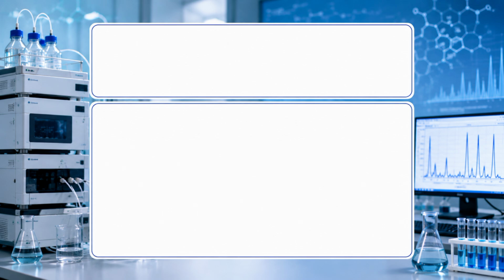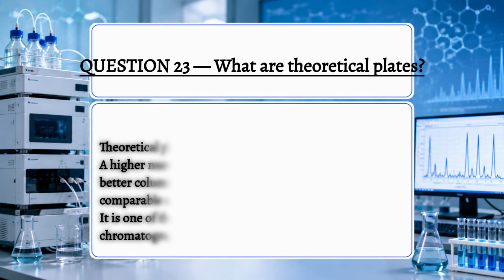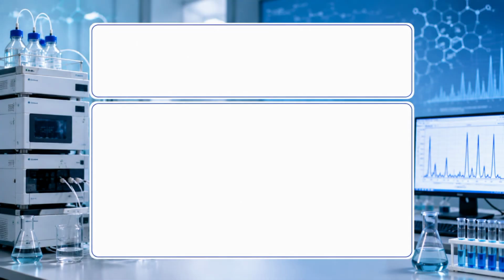Question 23. What are theoretical plates? Theoretical plates are a measure of column efficiency. A higher number of theoretical plates generally indicates better column efficiency and narrower peaks under comparable conditions. It is one of the important parameters used to evaluate chromatographic performance.